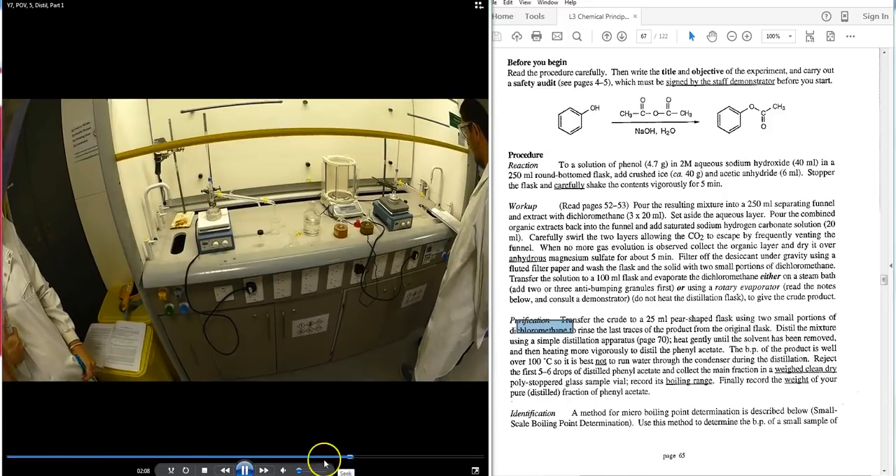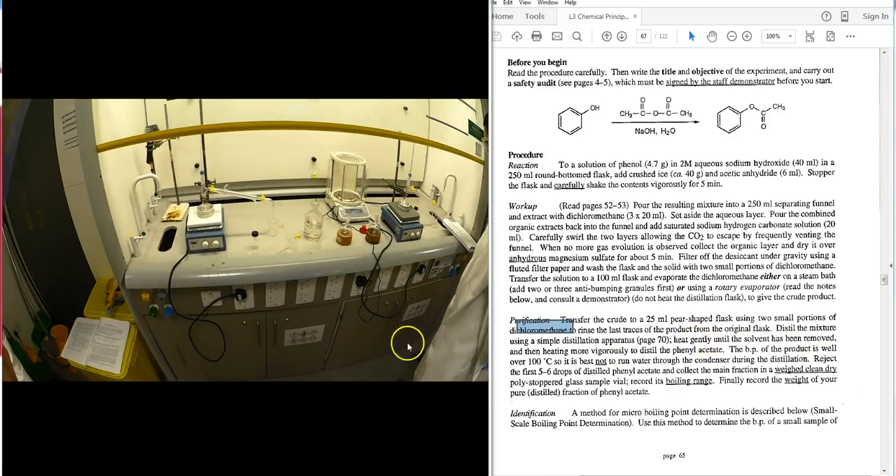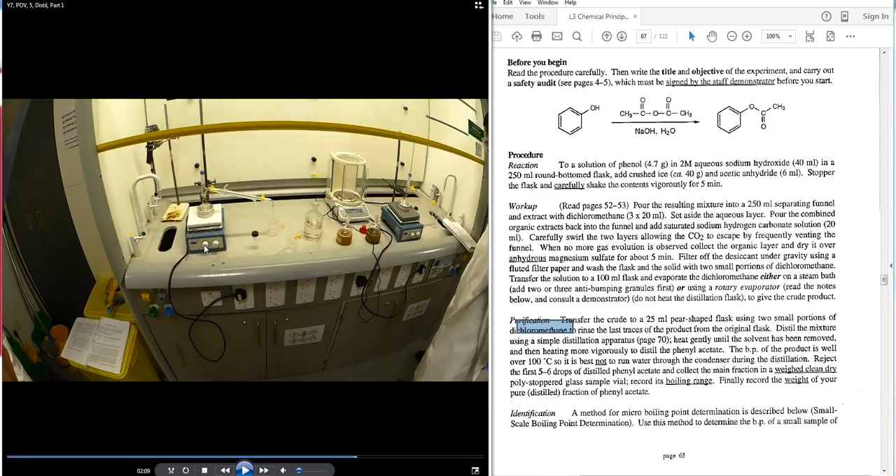It is noted that these students are doing the distillation without water flowing through the condenser. This is not the correct approach — water must flow in and out of the condenser. The correct procedure is to set up for distillation with the water cooling active.